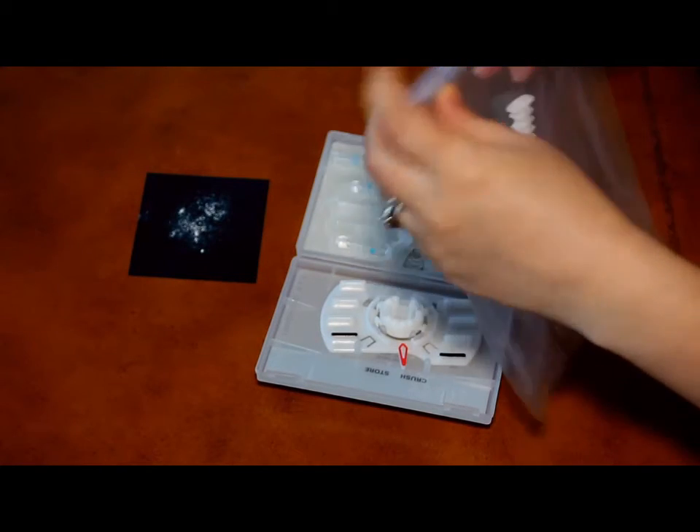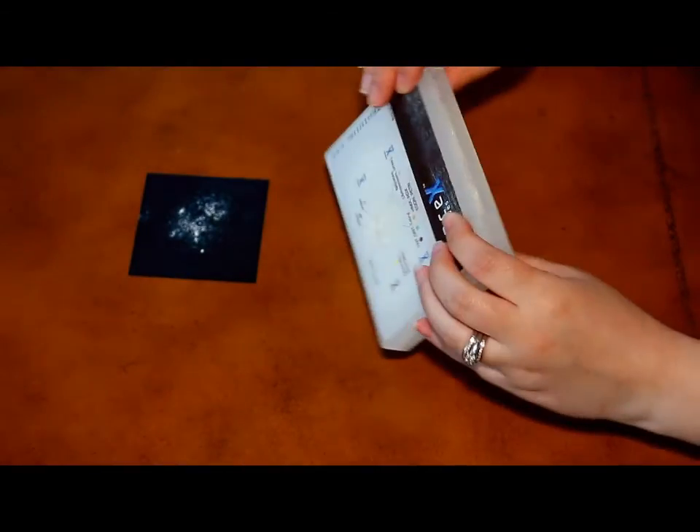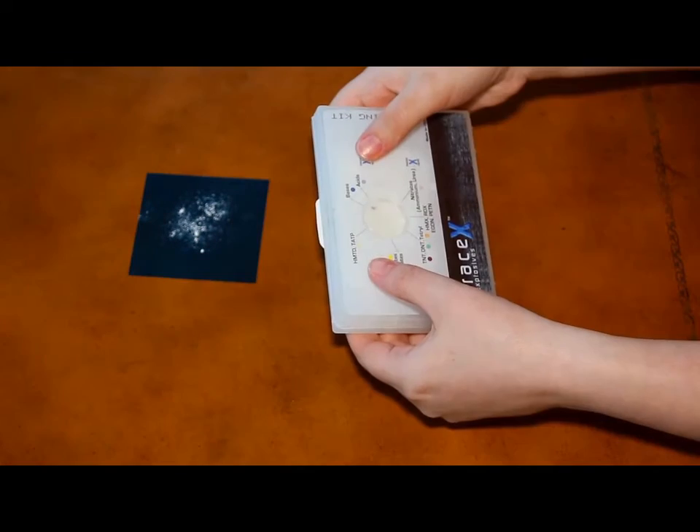Now, close the kit and ensure that the latch is locked. Crush the ampules by holding the kit in both hands and using your thumbs to forcefully press the lid in all four areas marked with an X.